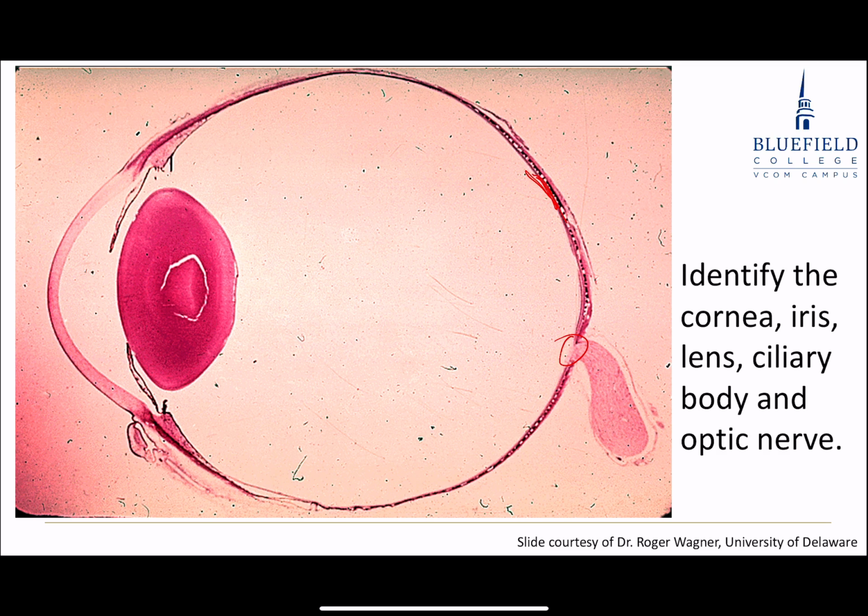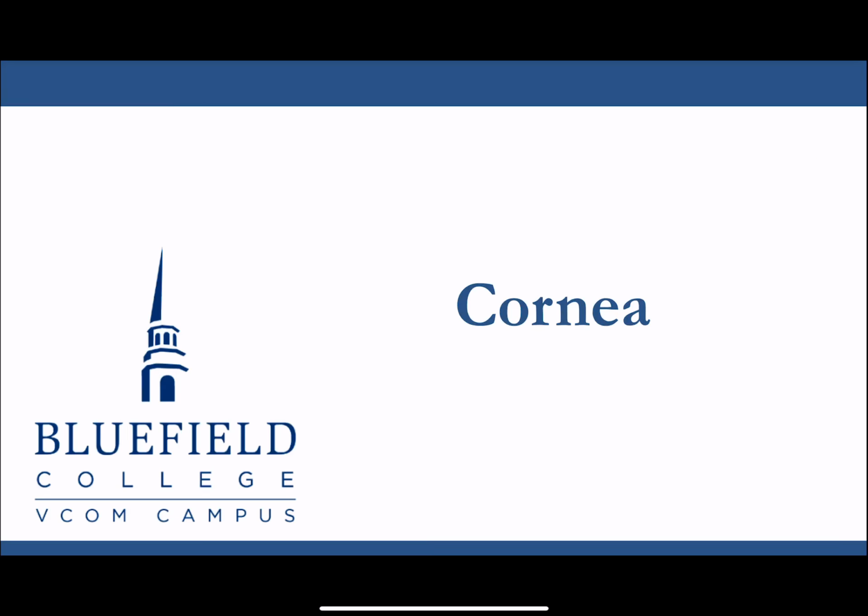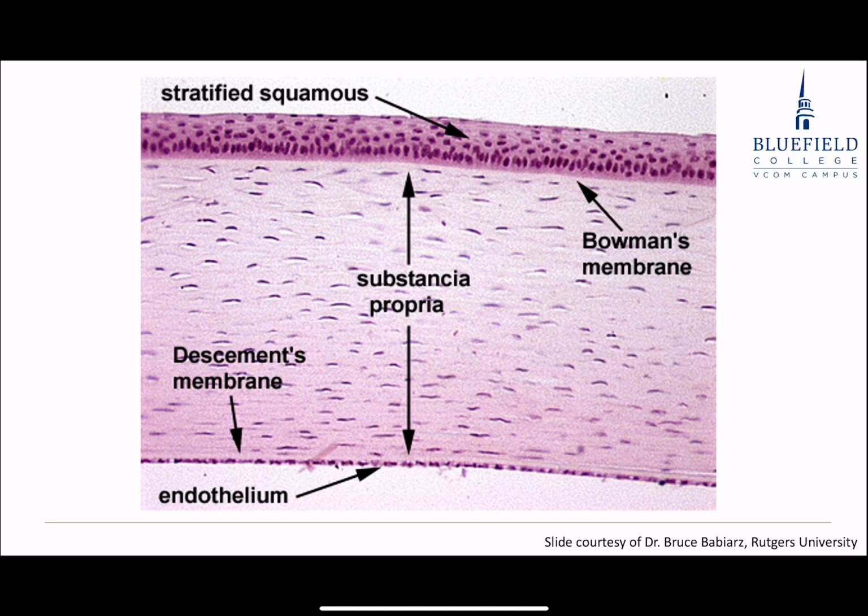All right, let's look at the cornea. Cornea, you'll recognize in the eye, it's got a stratified squamous epithelium up on the surface, not a whole lot of layer cells thick like we've seen other places, but definitely multiple cell layers thick, flattened nuclei or oval nuclei, long axis parallel to the surface, up on the surface, so stratified squamous.